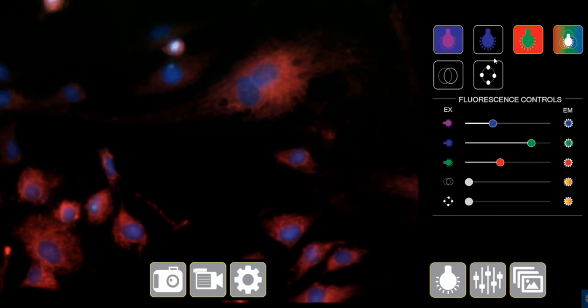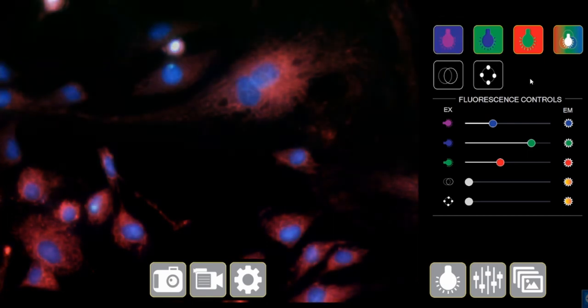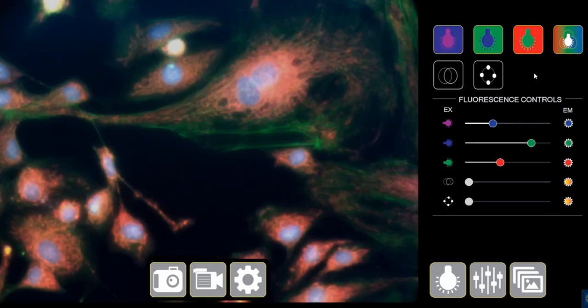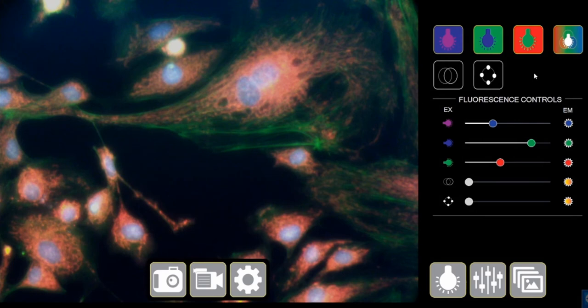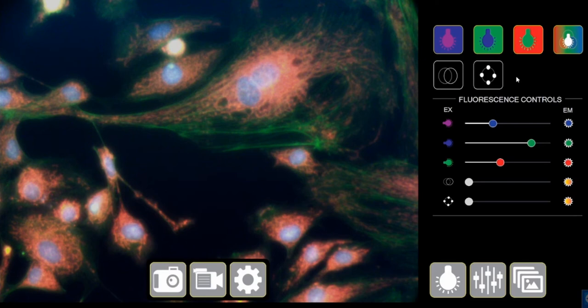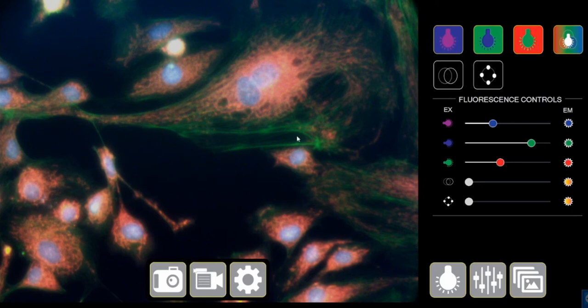This is one of the special features of this software. It completely removes crosstalk. You might see a little crosstalk through eyepieces, but it is completely digitally removed on the software side. This is made possible by the patented C-Bullet software.